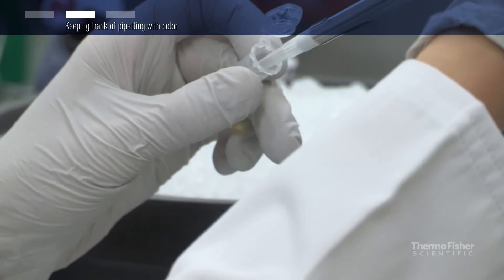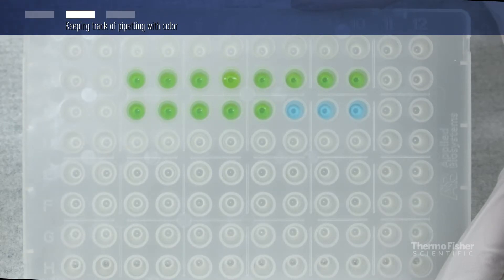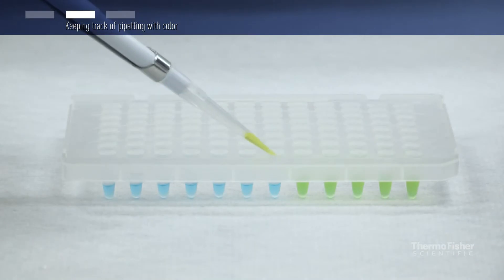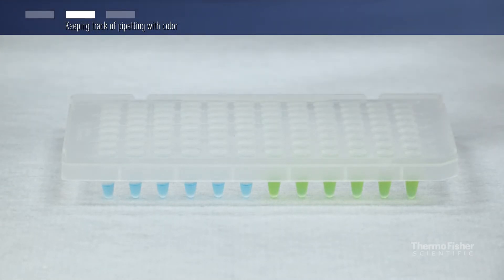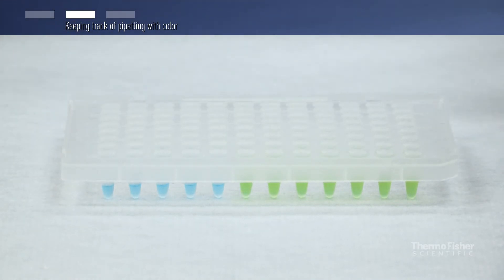Yellow sample buffer can be added to the DNA sample to track pipetting of the sample into the qPCR mix. The qPCR mix is blue before sample addition and turns green after sample addition. No matter which plates are used, clear or white, the colored mastermix and sample buffer reliably track your pipetting, making qPCR reaction assembly easy and frustration free.